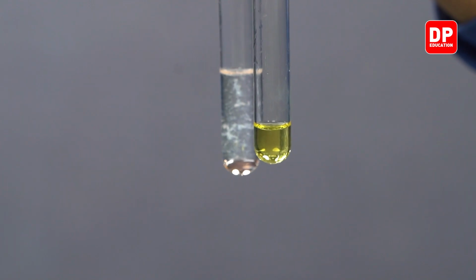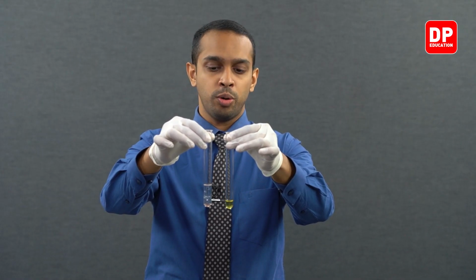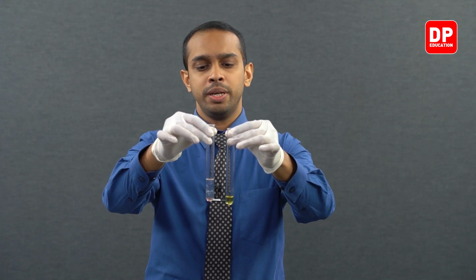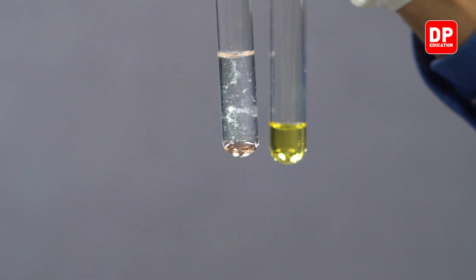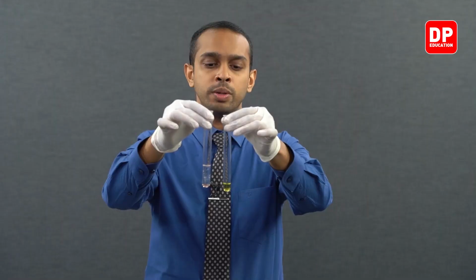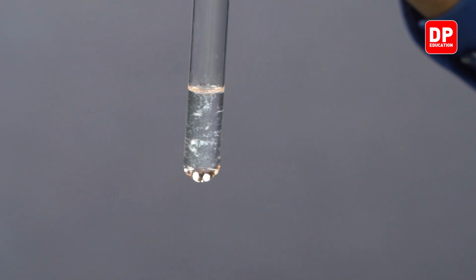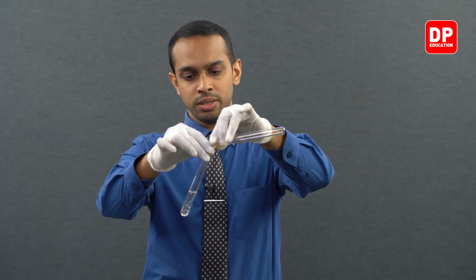and now you can see after adding phenol to this bromine water, we saw the color of bromine water disappeared, as well as a white color precipitate started to form, which is 2,4,6 tribromophenol. We'll add this sample of bromine also into this mixture.